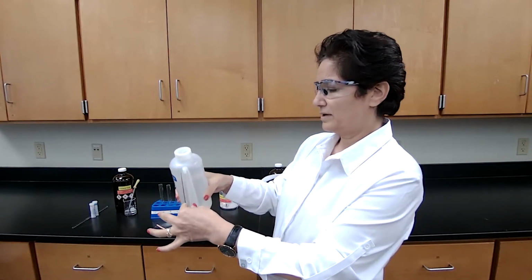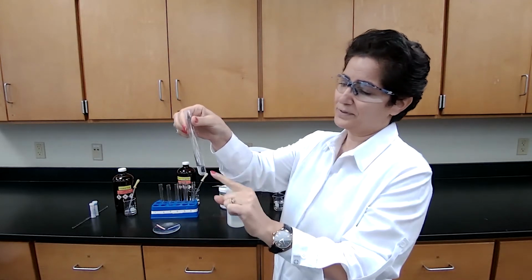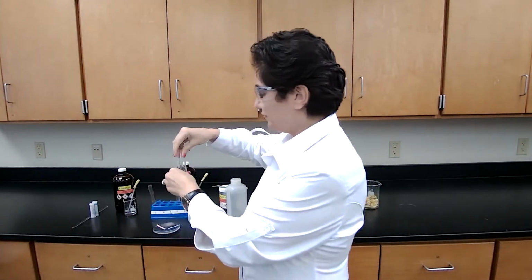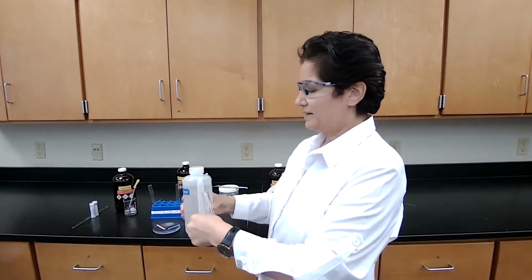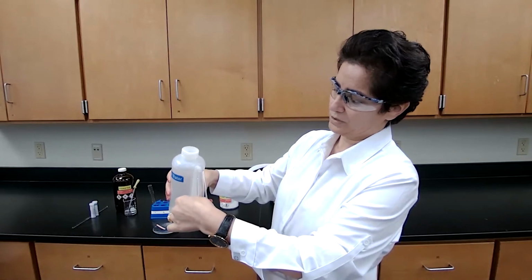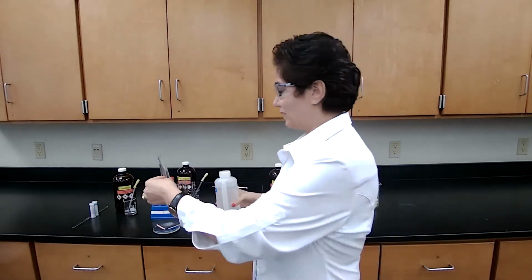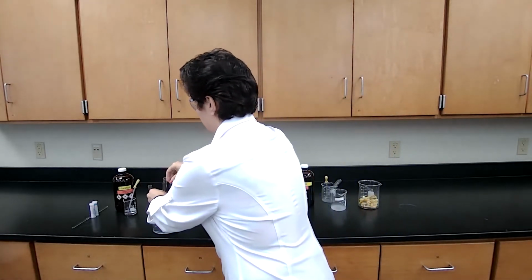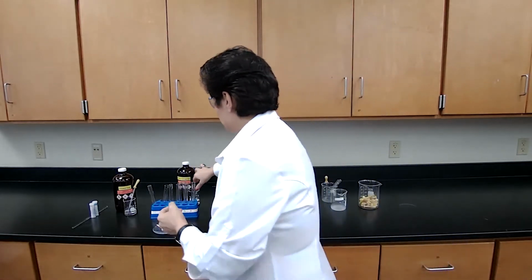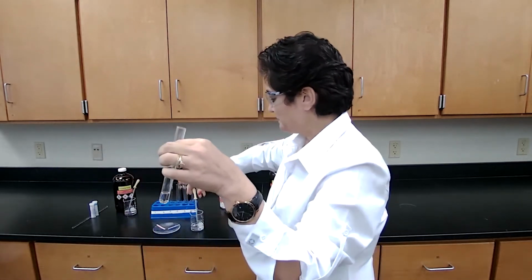I'm going to give about 1 inch of water, based on the procedure for the experiment. I'm going to dispense the water first into the test tubes. Then I will add one of the compounds, and I will try to show you what happens based on the solubility. While I'm doing the experiment, I will also explain the procedure. Okay, so I have ethanol. I'm going to start with the solubility of ethanol in water.